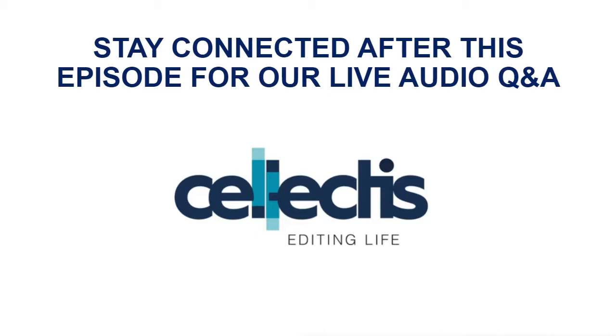Pivoting a little bit into the electroporation technology before we go back to the gene editing questions, and this may be a good question for Paris or David Sourdive: what are the regulatory requirements for approval of the PulseAgile gene engine, and where are we in that process?